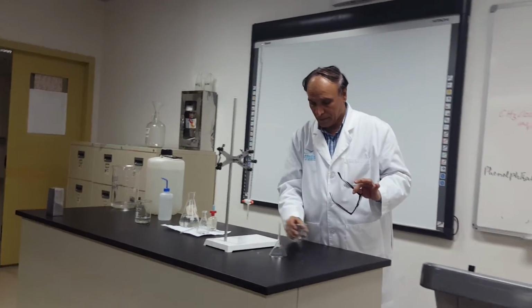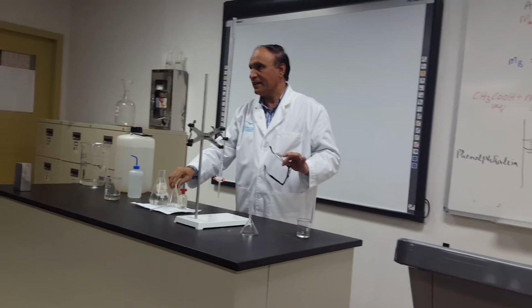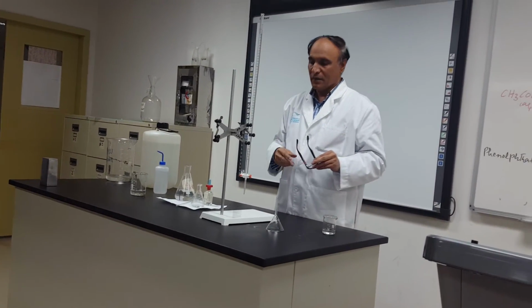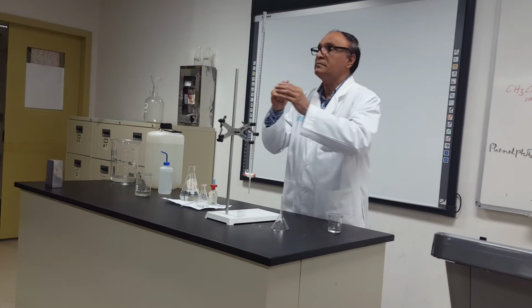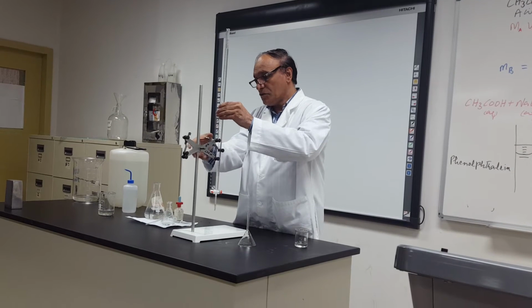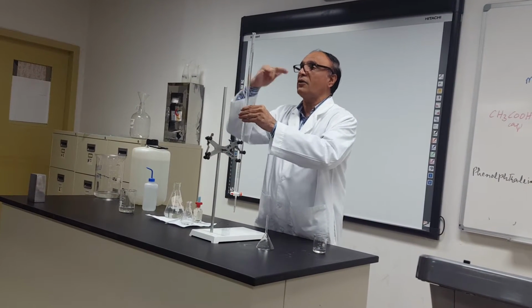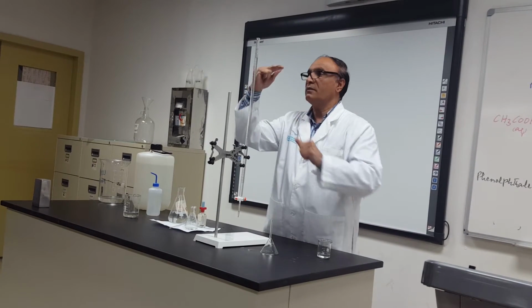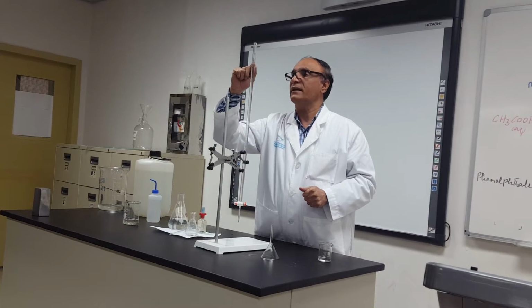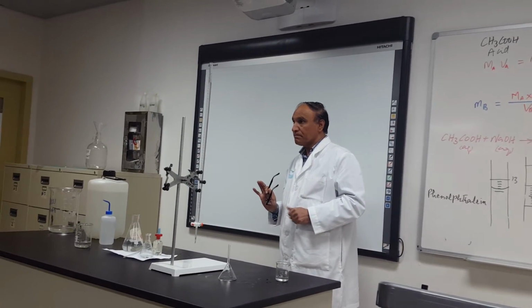Now, this is ready. This one is ready and this is ready. I will take the initial reading. I will look into that. To take the reading, I will take it in level. You can move it above or below according to your height. So bring it in level of your eye. And now you read from here, this one. Right? Did you understand? Yes.